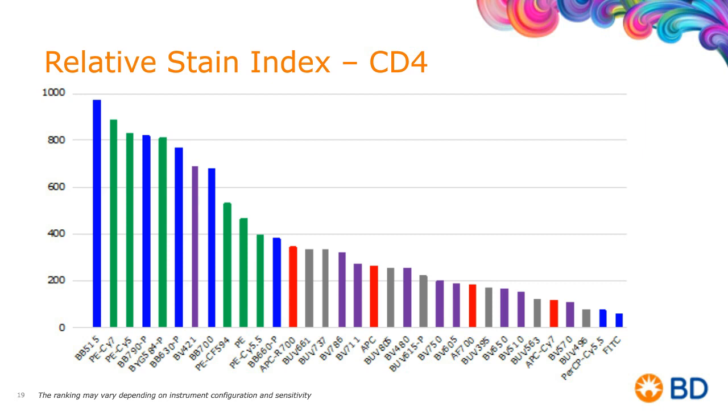Now, it doesn't mean that we just need to replace FITC, because FITC is a fantastic color. It works inside the cell. It's something that has been conjugated to so many specificities that we can find a place for it. But in your panels, if you had many specificities where there's many different low expressed, well, there's an option for you to use in that same channel, not FITC, but Brilliant Blue 515.